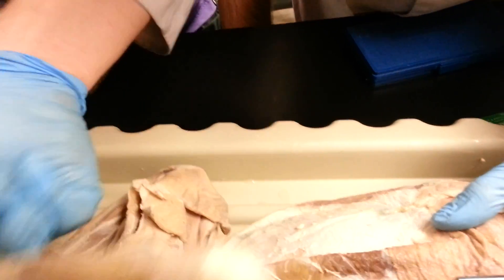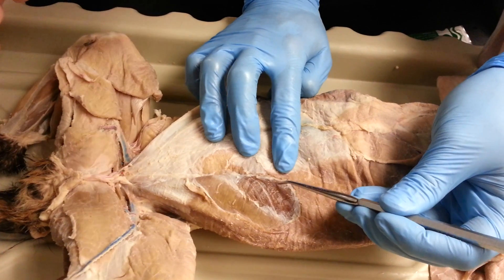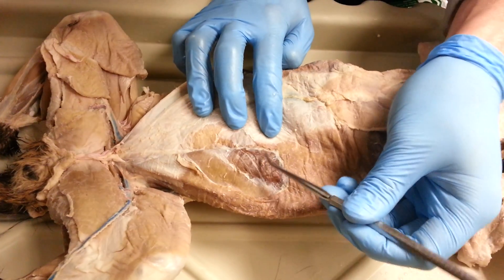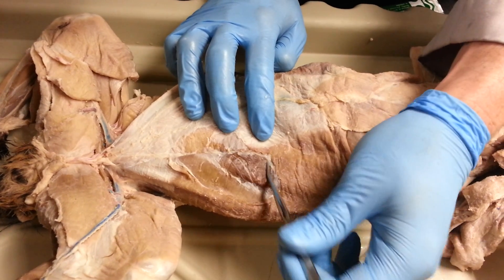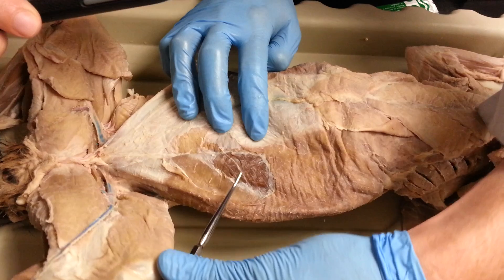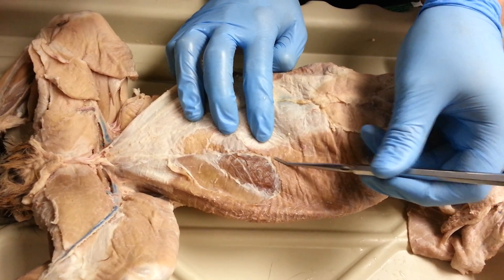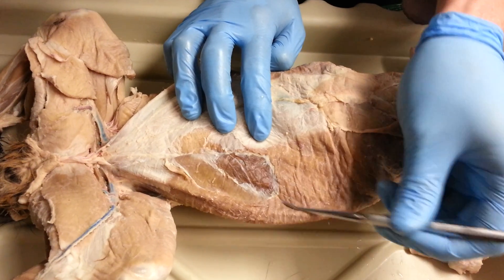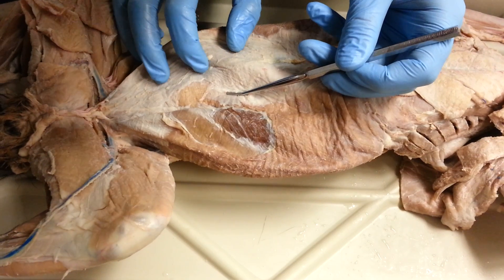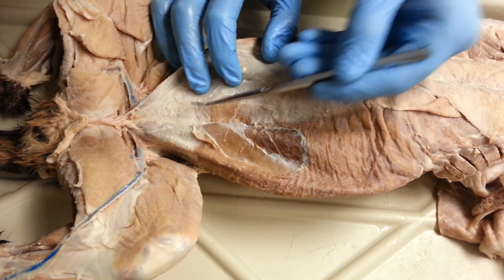That's most of the lower body. There are a few more things we have to talk about, such as the abdominal wall. Here we have our transverse abdominus, which has fiber patterns that run mostly this way. Then we have our internal oblique, which has fiber patterns that mostly run this way. And then we have our external oblique, with fiber patterns that run mostly this way. And then there's a rectus abdominus — this specimen doesn't show a very good rectus abdominus, unfortunately, but it would have fiber patterns that run straight up and down.